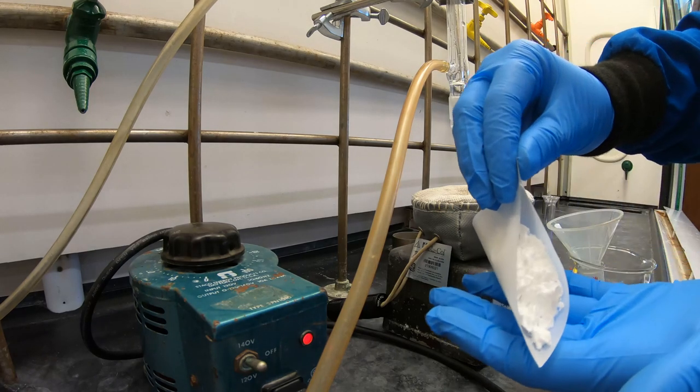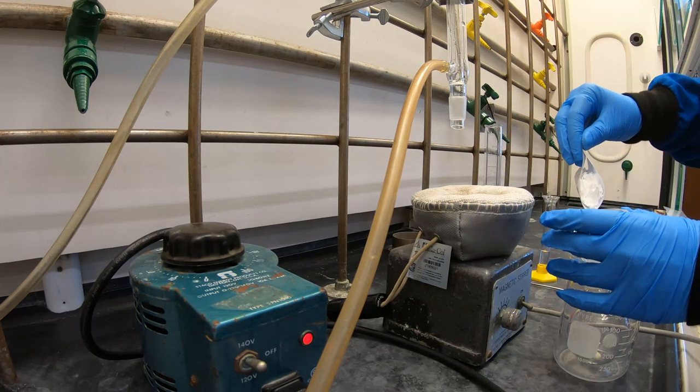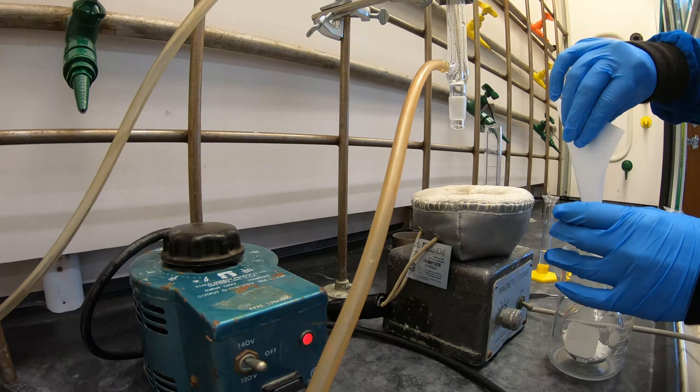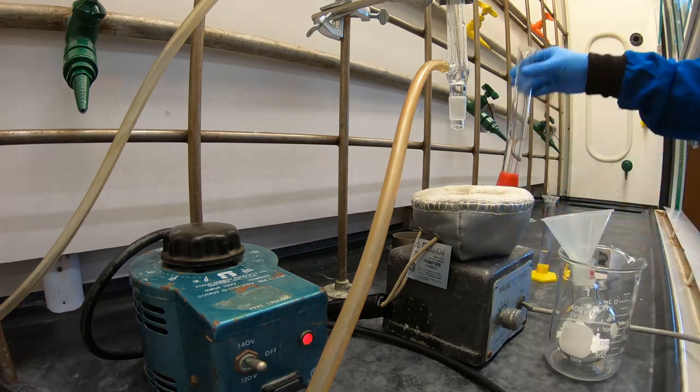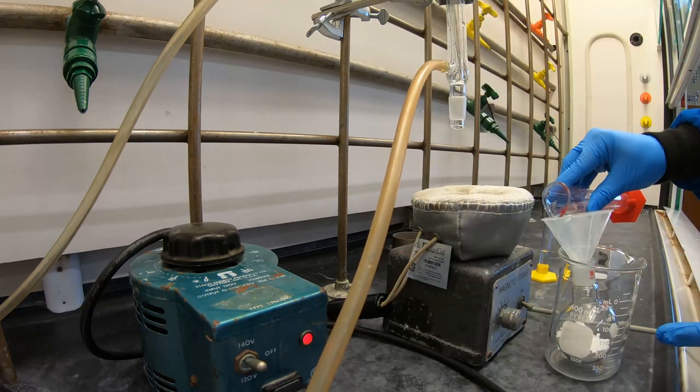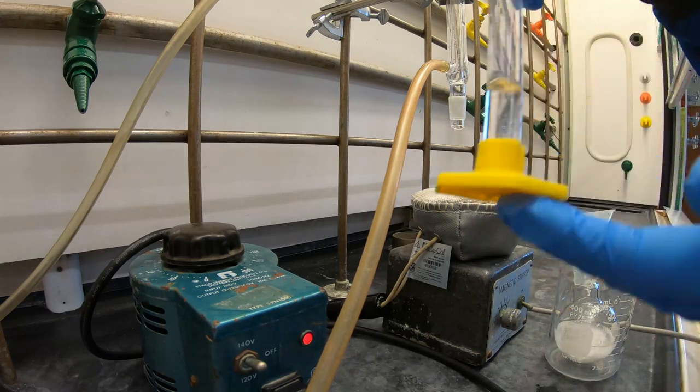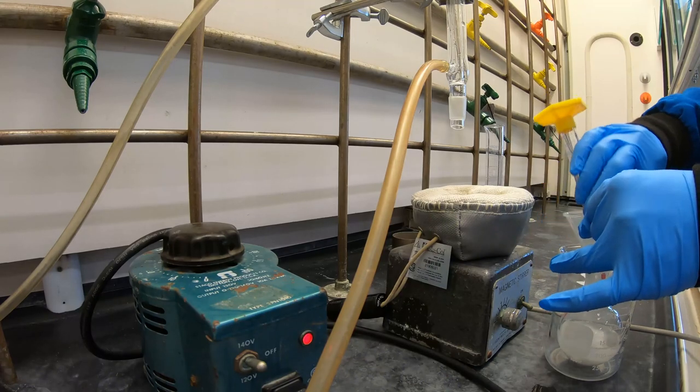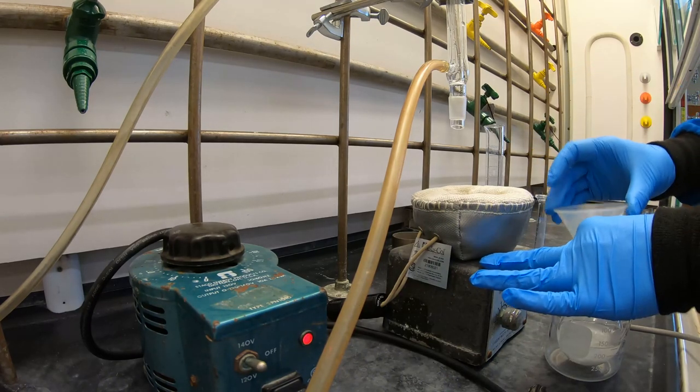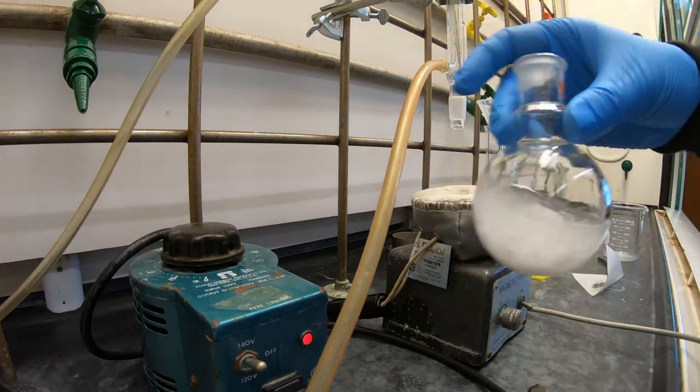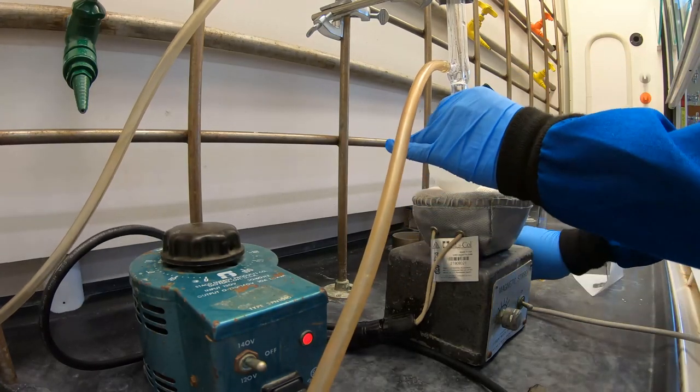To a 100ml round bottom flask, add your alpha chloroacetyl-2,6-dimethylacetanilide that you made last week. Follow this by adding 45ml of toluene. Then add 3 moles of diethylamine per mole of your acetanilide product. Make sure you have a stir bar in your round bottom flask. Then connect it to your reflux condenser.